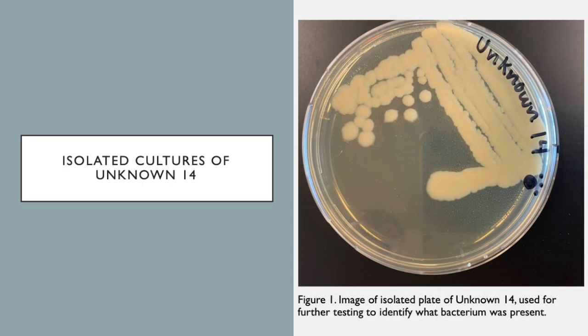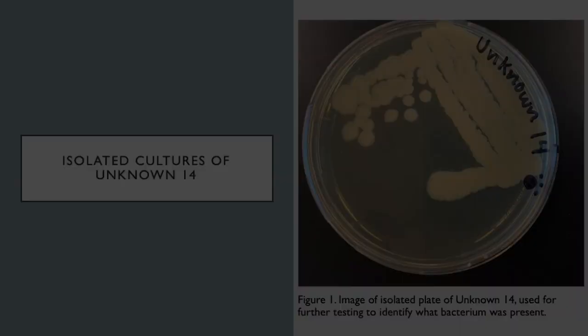A CSF sample was collected, and from that we were able to isolate colonies of unknown 14. Our job was to figure out what the bacterium is, why it's causing these symptoms, and how to combat them.